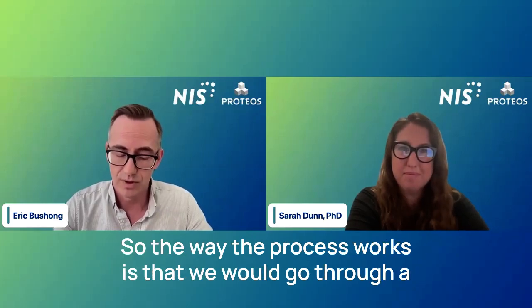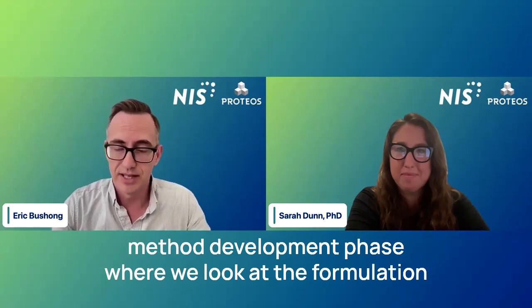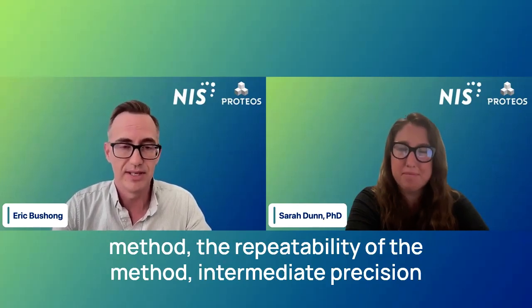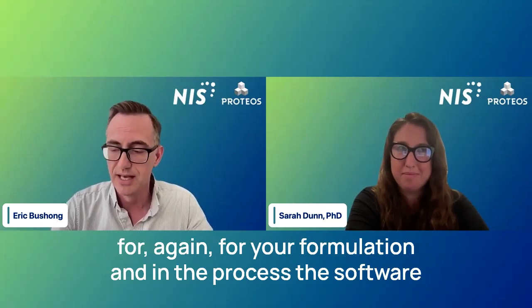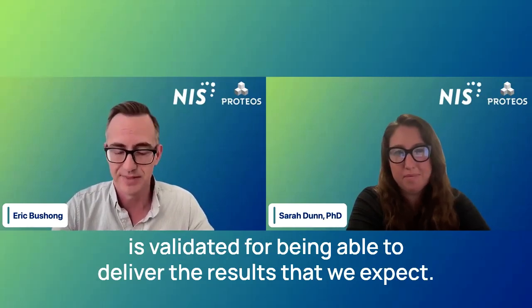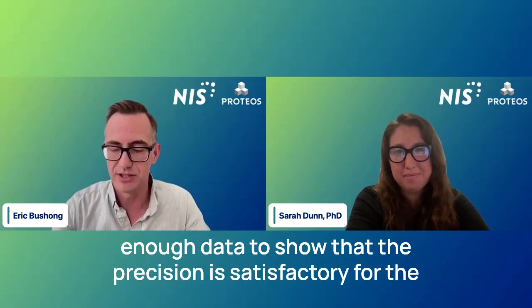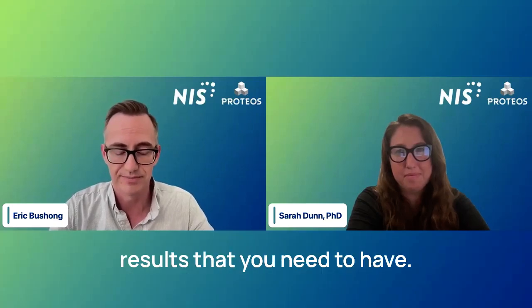So the way the process works is that we would go through a method development phase where we look at the formulation that's sent to us, and we establish things like the linearity of the method, the repeatability of the method, and intermediate precision for your formulation. In the process, the software is validated for being able to deliver the results that we expect. And then there's a final formulation phase where we collect enough data to show that the precision is satisfactory for the results that you need to have.